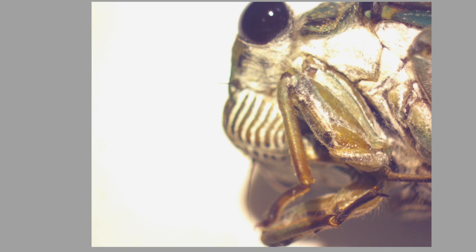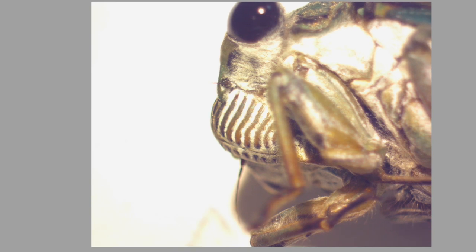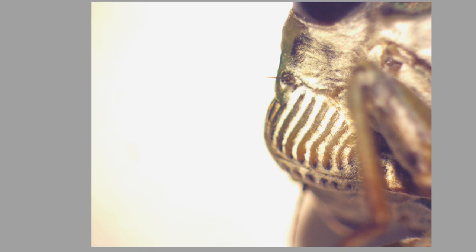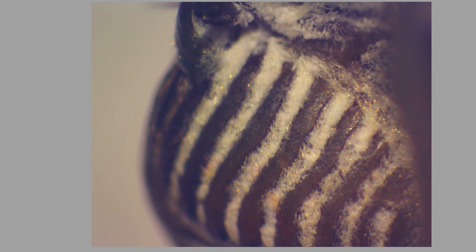Okay. Let me see if I can flip this guy over. Or girl. Looks like that, huh? So much hair on bugs. It's amazing. I don't know why. I think it's to feel the wind, and because when there's changes in the air pressure, it tells you when someone's near you. So it's a useful thing for that. Up to 30 again. I like his grill. I don't know why. I just like it.